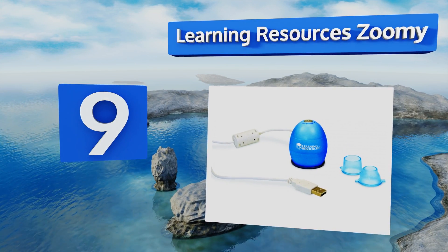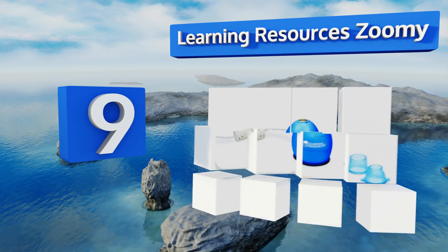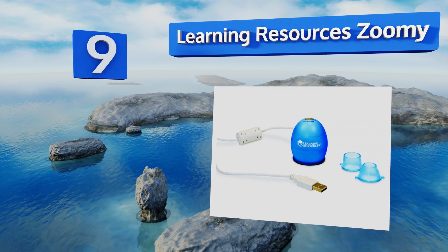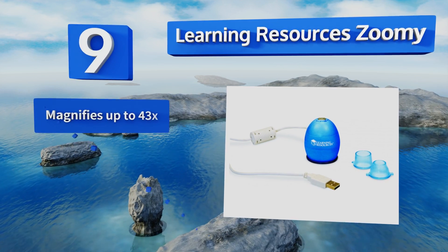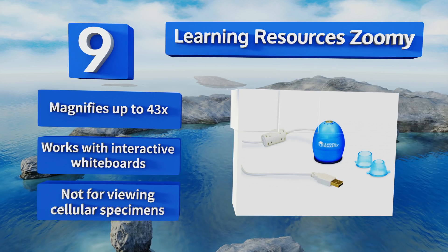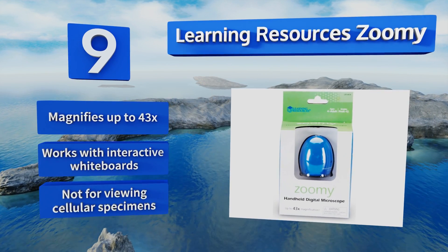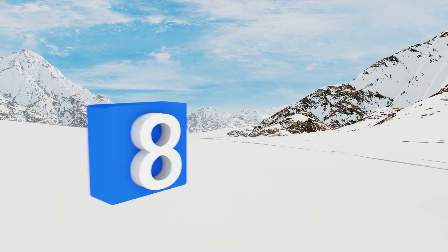At number nine, the Learning Resources Zoom E is the perfect all-in-one choice for young students. The egg-shaped housing fits into a small child's hand, making it easy to position over objects at any angle. Children can view their discoveries on the computer screen. It magnifies up to 43 times and works with interactive whiteboards, but it's not for viewing cellular specimens.